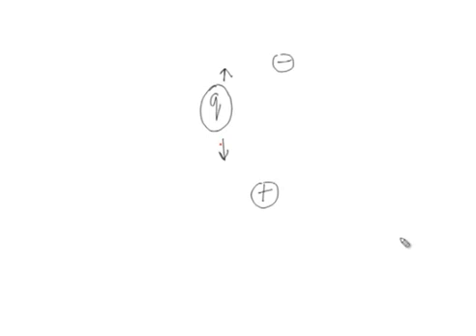As this charged molecule moves, it experiences a particular force, and this force is given by the electric field that is applied and the charge. So, EQ, where E is the applied electric field and Q is the charge. The force experienced by the charged particle under the influence of the electric field is EQ.